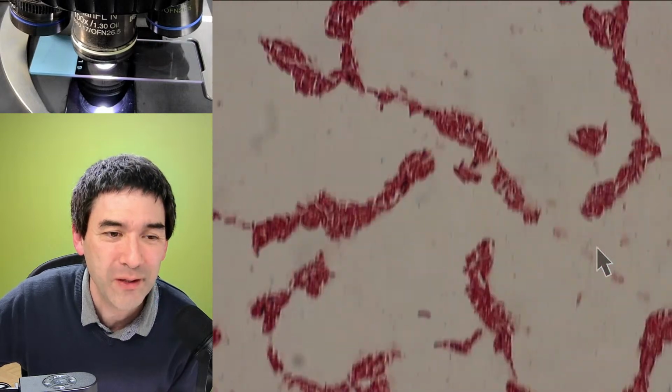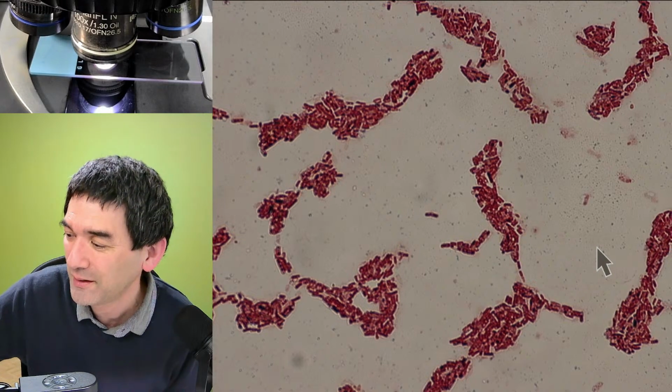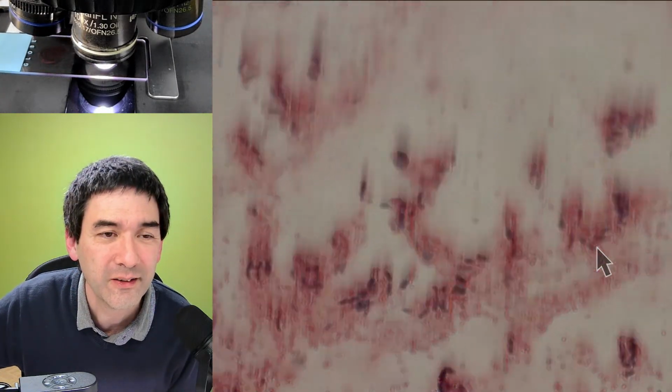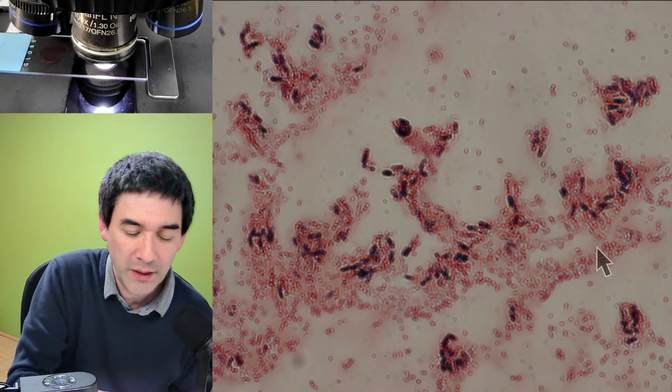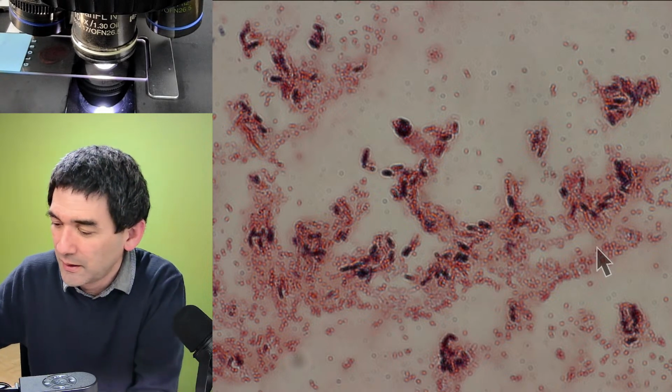This was one of these big colonies, while the other one I kind of tried to scratch off somewhere in the center, and here again. Very nice. You know what? I'm going to show you also the other one that I made today in the morning. Okay, and here it is.